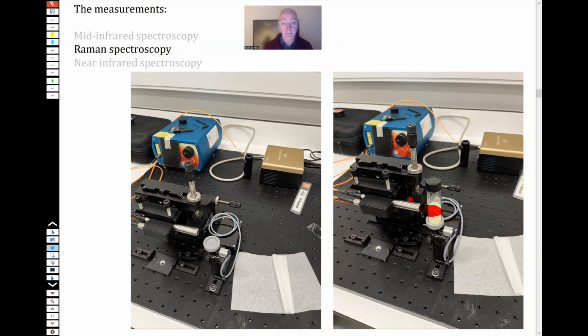Then the light is scattered back, and the light that's scattered back is then collected in a different fiber and then carried away to the spectrometer, which is over here, and then it's measured. It's as simple as that. And of course, we put a black box over it because we're trying to measure a very weak signal against nothing. Remember that in an infrared experiment, you're measuring absorbance, which is I naught over I, or the log base 10 of I naught over I. In a Raman experiment, you're just measuring some scattering, as we'll talk about a little bit later on.